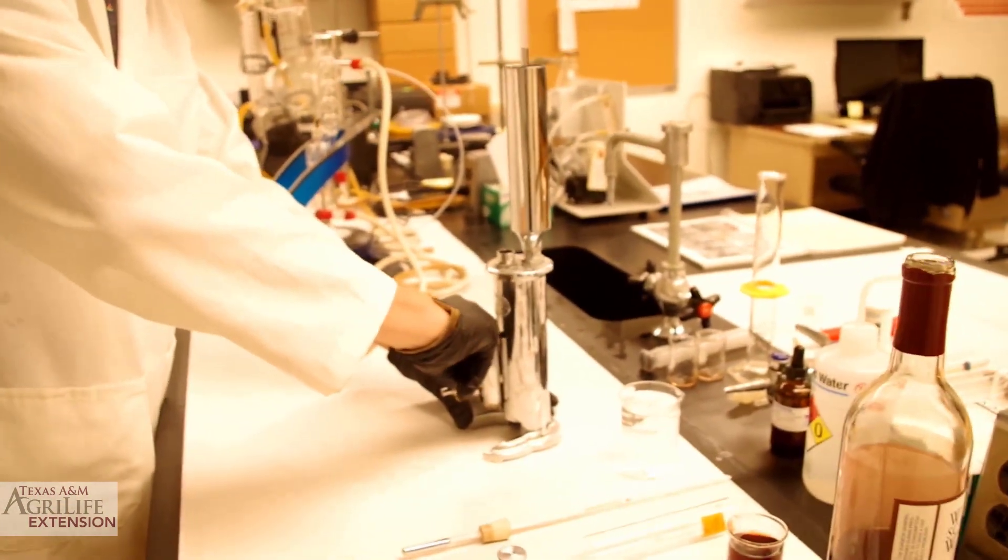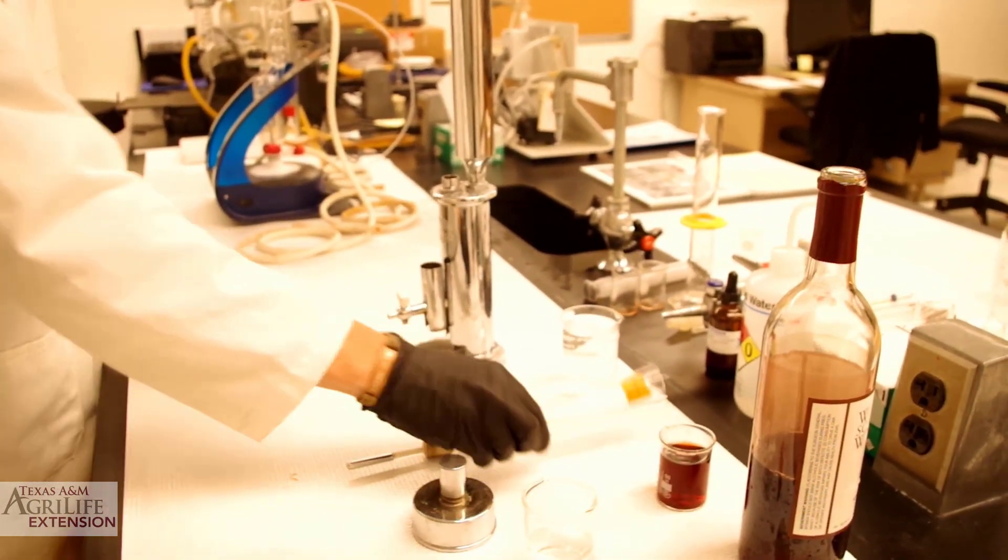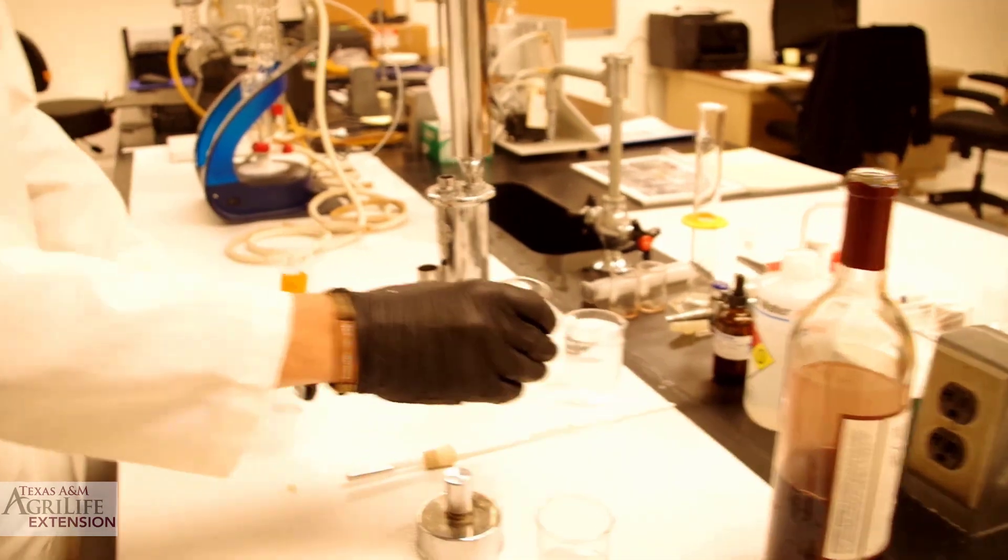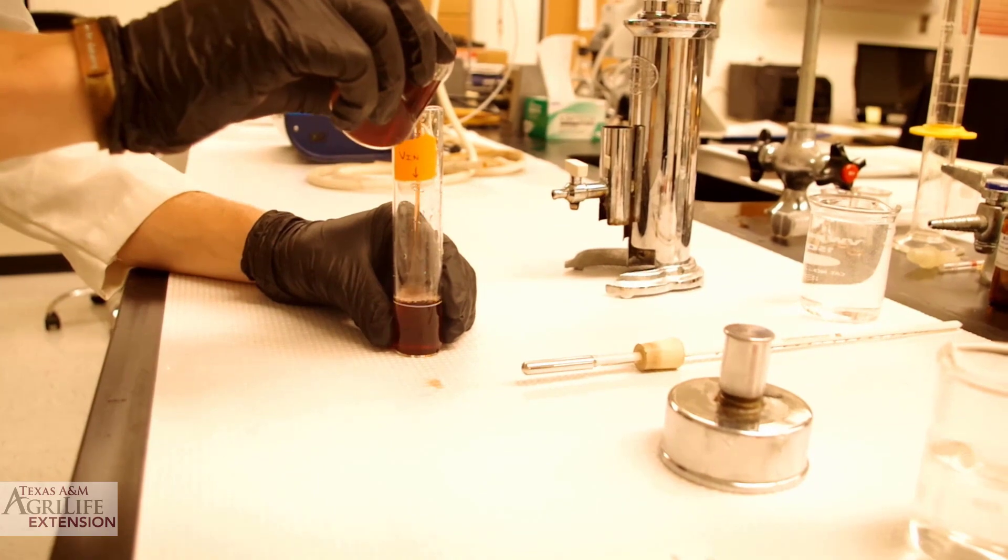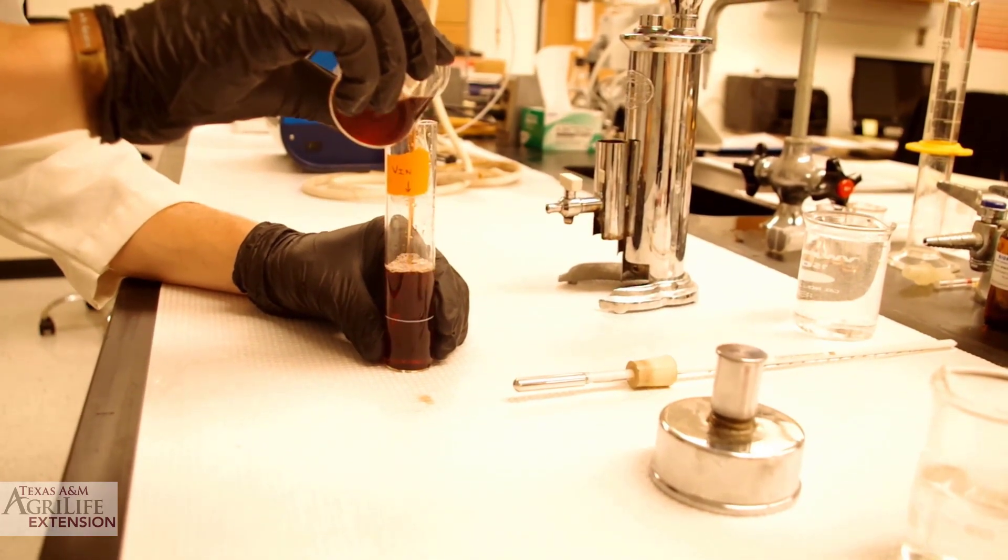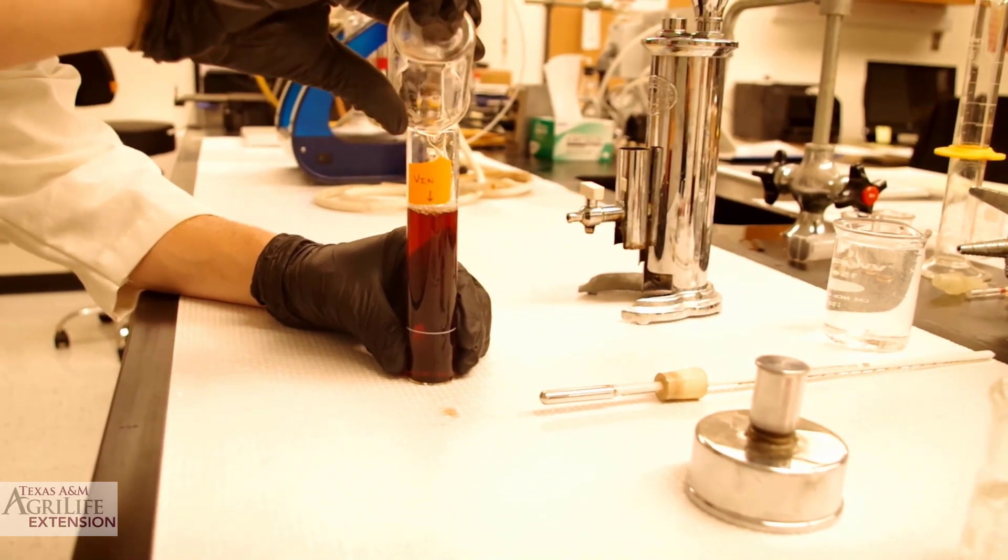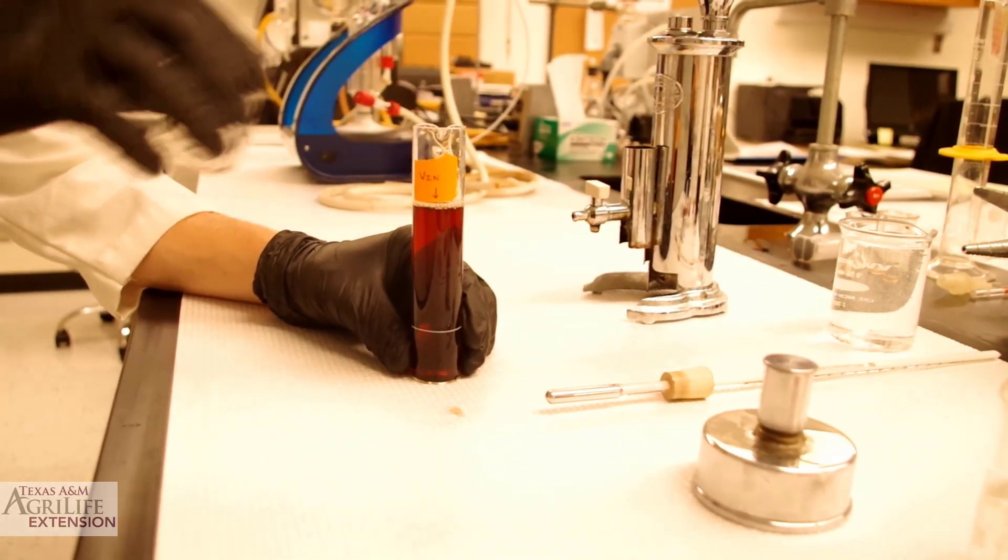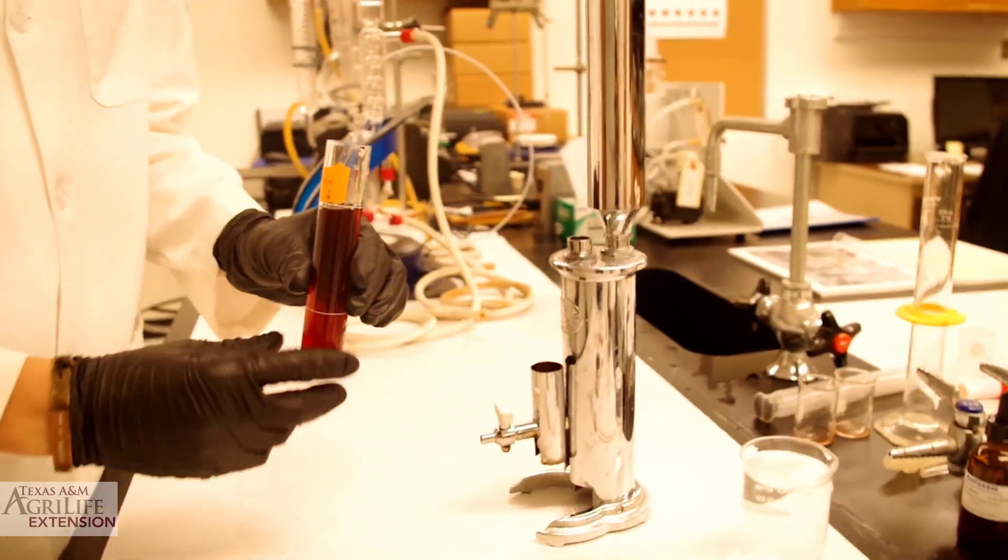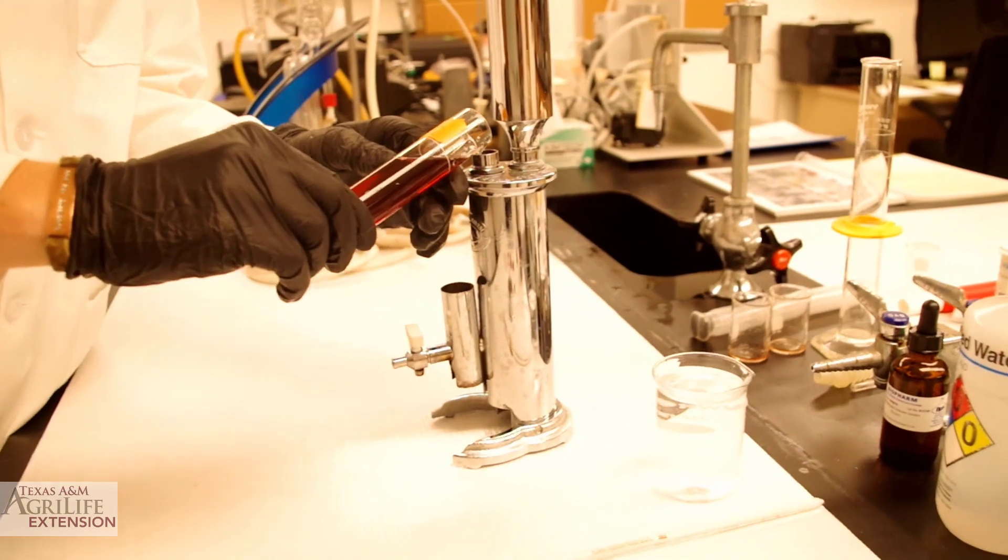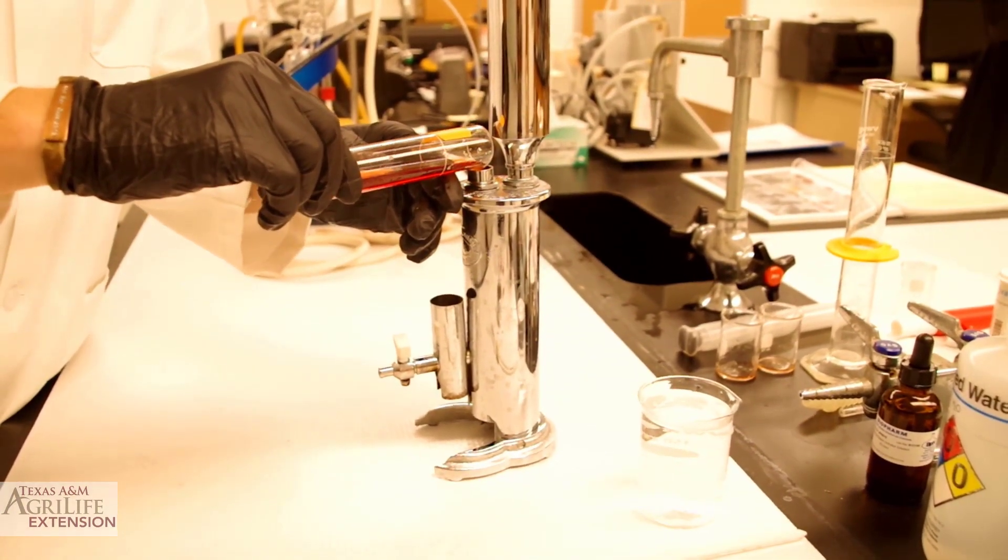Close the spout and proceed to measuring the proper volume for your wine sample. Using the measuring flask again, we fill it to the upper line, which indicates the required volume of wine. We can now pour our sample into the boiling chamber of the ebuliometer.